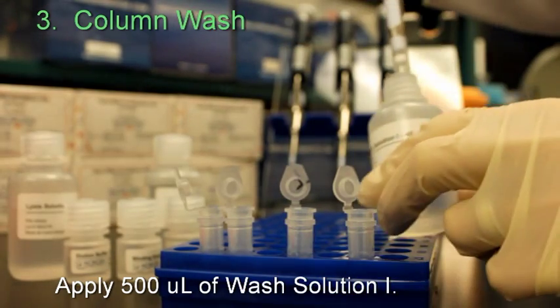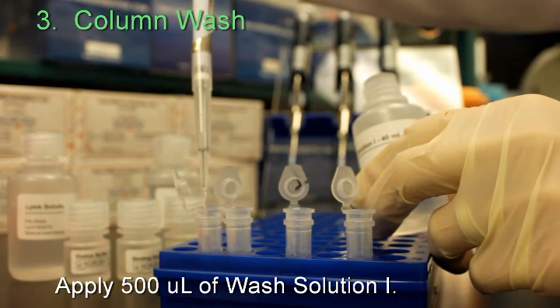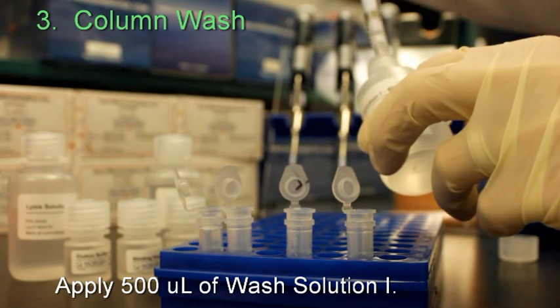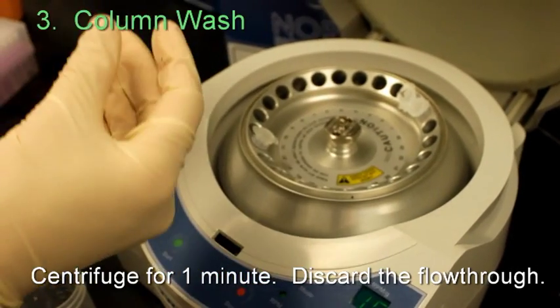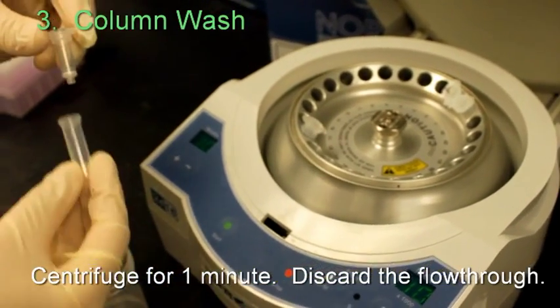Apply 500 microliters of WASH-1 solution to each column. Centrifuge for 1 minute and discard the flow-through.